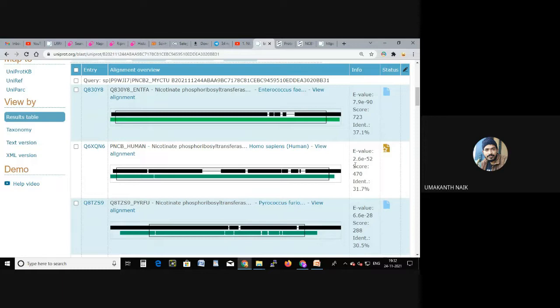What about Arvind? Are you following me? Sir, identity should be more than 30%, and the e-value should be lower.